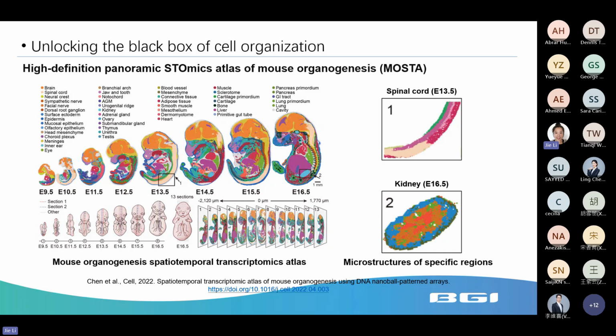Among them, 13 sections come from different cuts of the same 16.5-day embryo and construct a 3D atlas of the embryonic development near the end stage. The analysis in this cluster was performed on the embryo of each section, identifying the main tissues and organs that match each time point, such as skin, bones, muscles, heart, lungs, etc. And there is tissue-specific expression information.